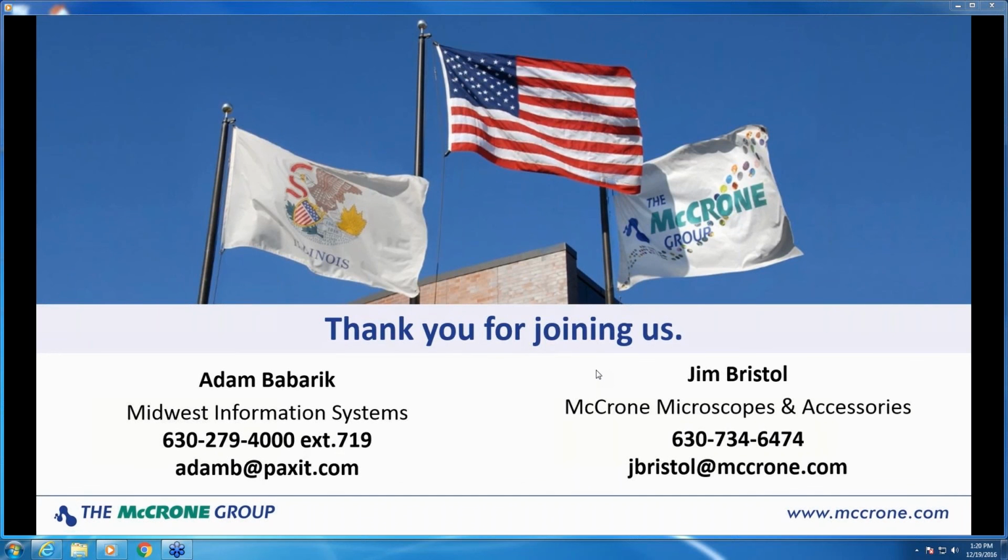Okay. Looks like we got a question here from Jeff. Can extended security be retrofitted with existing microscopes and cameras? That's for you, Adam. Go ahead. Thanks, Jim.